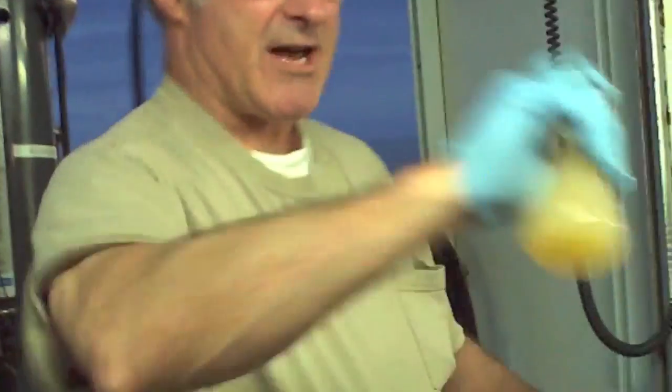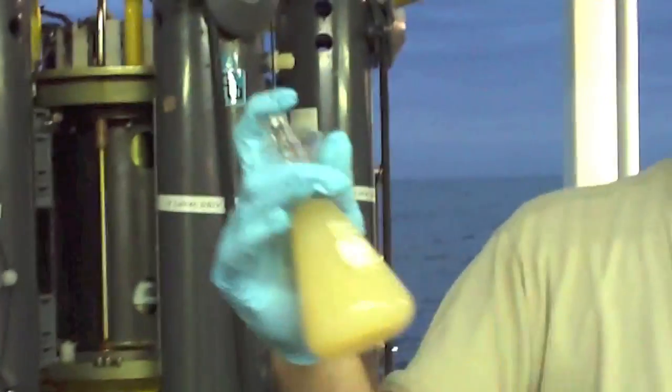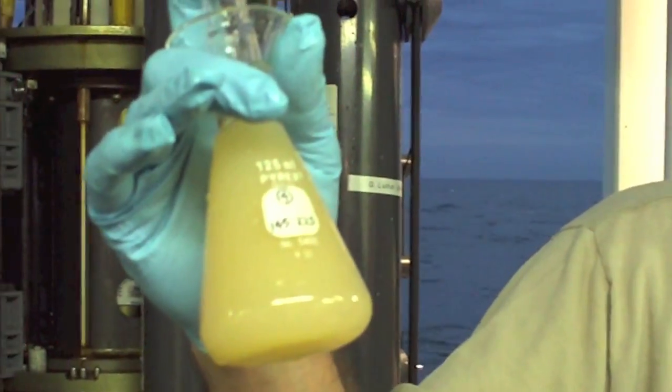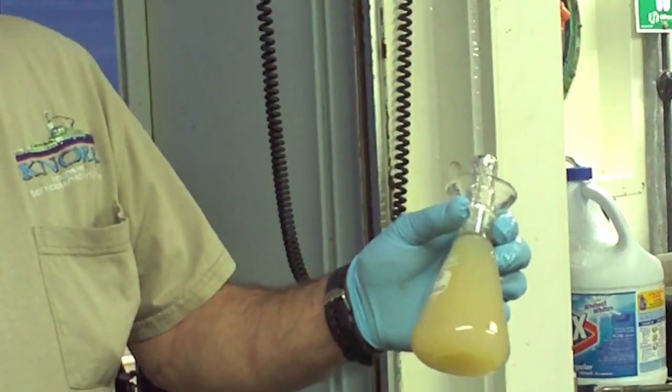Now the darker this glass gets, the more oxygen there is. When we do work in the Chesapeake Bay in the bottom waters, there's absolutely no oxygen, and so this would look entirely white with no brown. And you can see that it's nicely brown. So we let this sit for half an hour to make sure that all the oxygen has reacted with the manganese II that we put in to form the manganese III compound. And we do this in replicate up to three or four times so we have good statistics on our values.